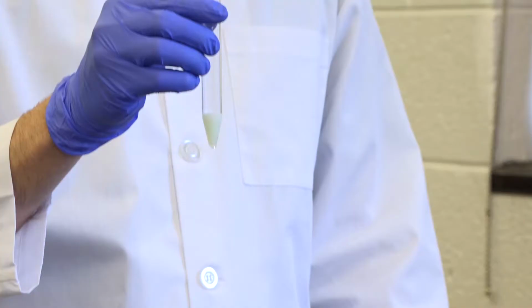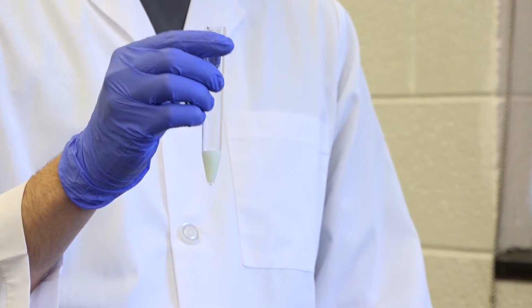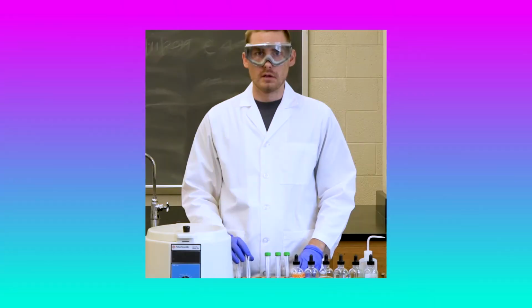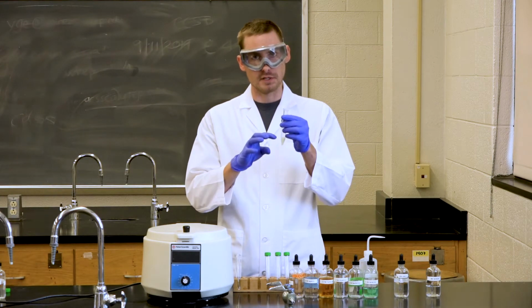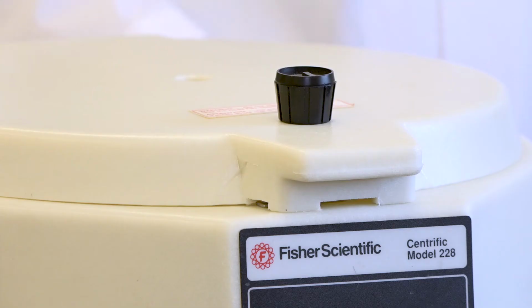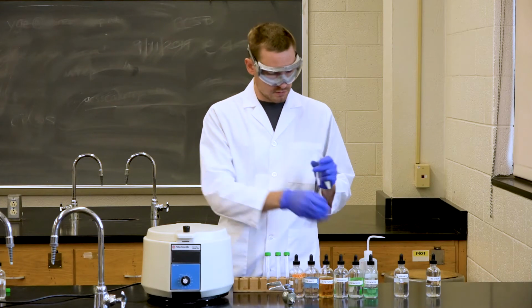So as you can see, a white precipitate is formed in our test tube. We will now need to separate the solid from the liquid by using a centrifuge. So to make sure that the centrifuge is balanced, we need to add about the same volume of liquid in another test tube as we have in our first test tube. We will then place them in the centrifuge directly opposite one another, and that will allow them to be balanced.